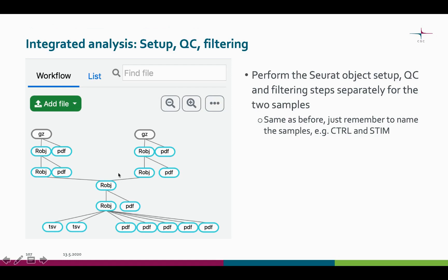Here you can see the pipeline in Chipster. Here are the two samples. As you can see, the first steps are performed for both samples separately. The only thing we need to remember to do in the very first step is naming of the samples, so that they can be distinguished later on. For plotting purposes, we use these short names in capital letters.